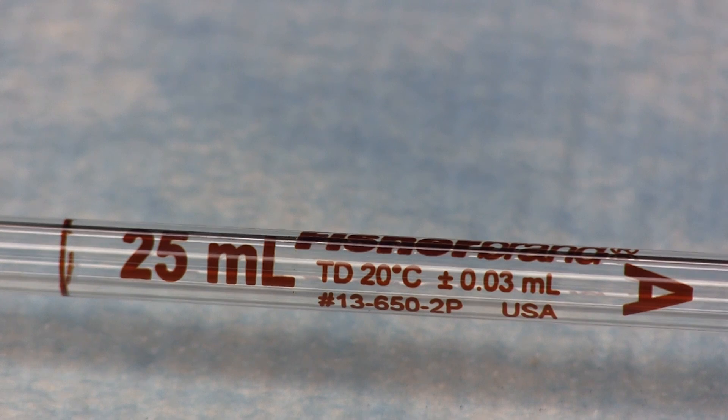For our purposes this means that the precision is two decimal places. The manufacturer calibrates the pipette at a temperature of 20 degrees. So this means that we can transfer a volume of 25.00 milliliters of liquid with this pipette provided that it is used properly.